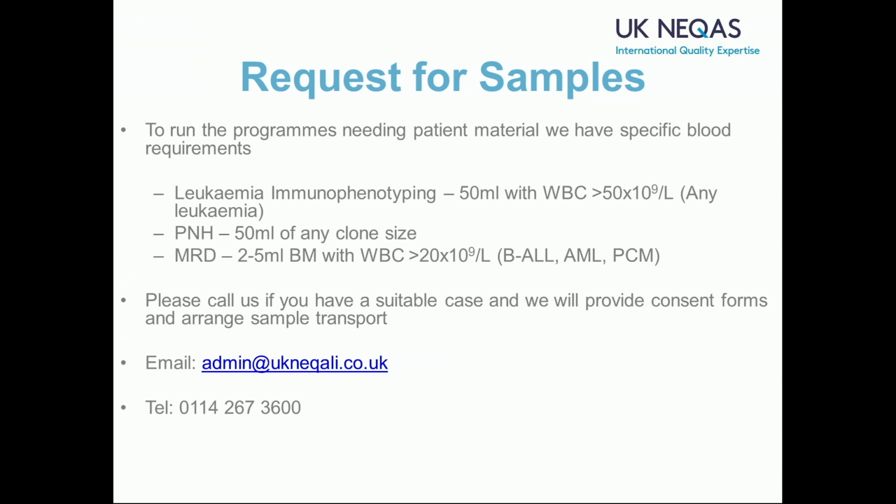What we are going to do is email all of the laboratories the kinds of samples we're looking for. Just give us a call, and we'll arrange transport if you've got a suitable case. We'll provide consent forms if you have clinicians who like taking samples from patients. Or bear in mind that any waste material you have in terms of clinical audit can be used for EQA.